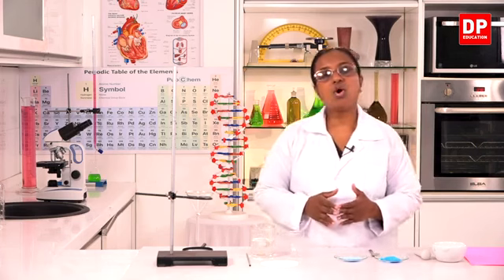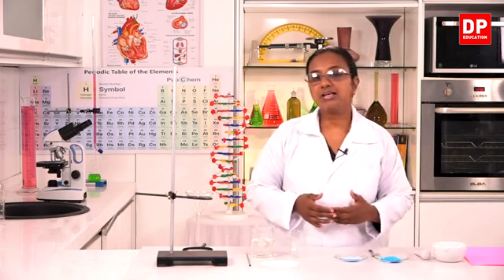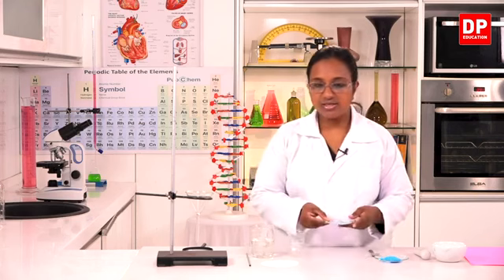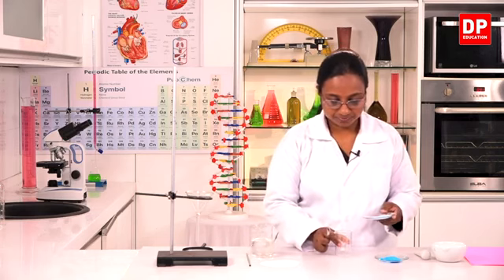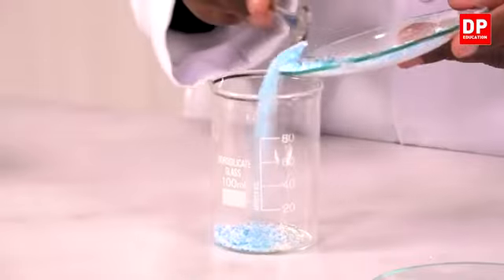Then I will move on to the second part of the activity, or the second activity in your textbook, where I will dissolve this substance. I will transfer it into a beaker. Transfer the mixture into a beaker.